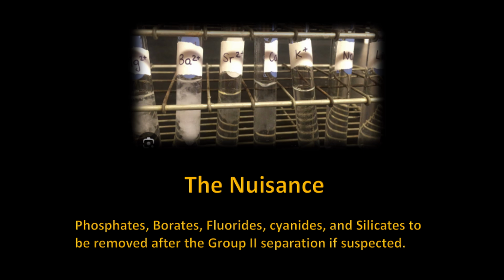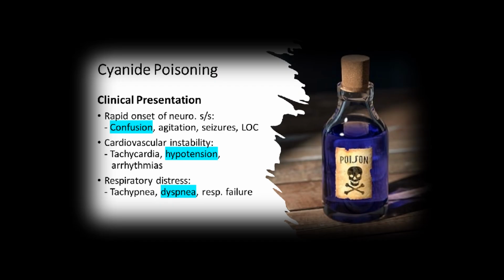To remove the fluorine and boron, do so by multiple evaporation using concentrated hydrochloric acid. The last evaporation is done to a small bulk. Then adding 2 mL of bromine water, boil the solution to a small bulk and add solid ammonium chloride. Transfer that to a test tube and then add 6 molar ammonium hydroxide until it's just alkaline. Then complete the separation of the group 3 compounds. This is important and must be addressed.